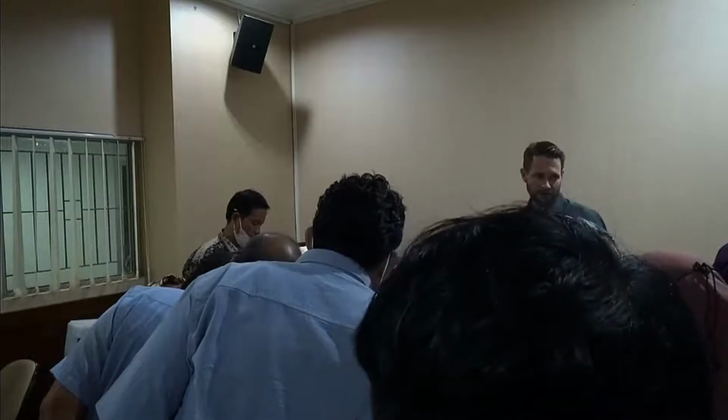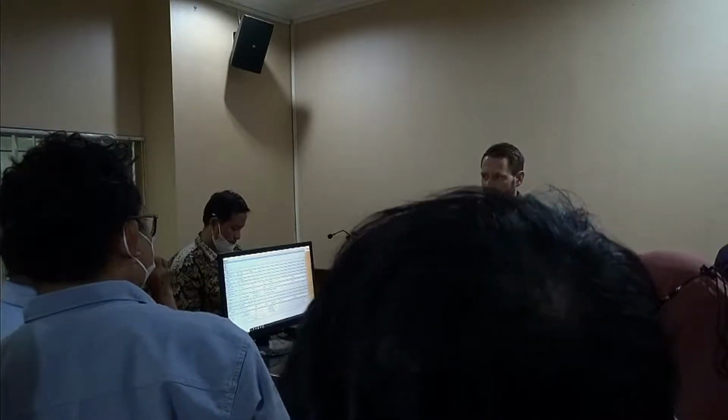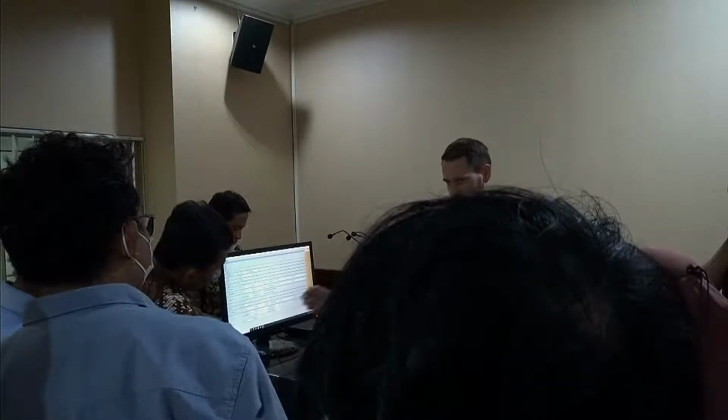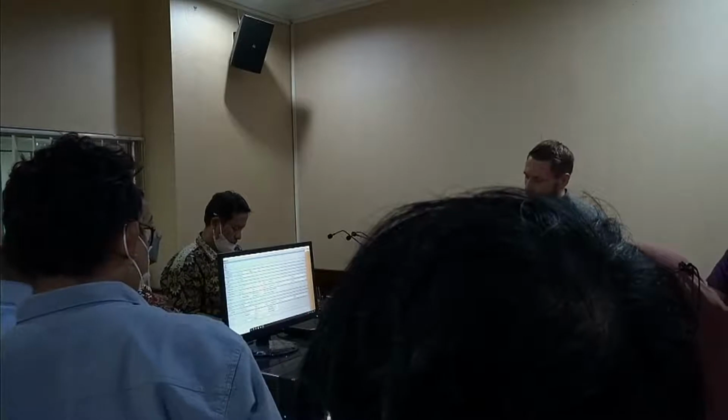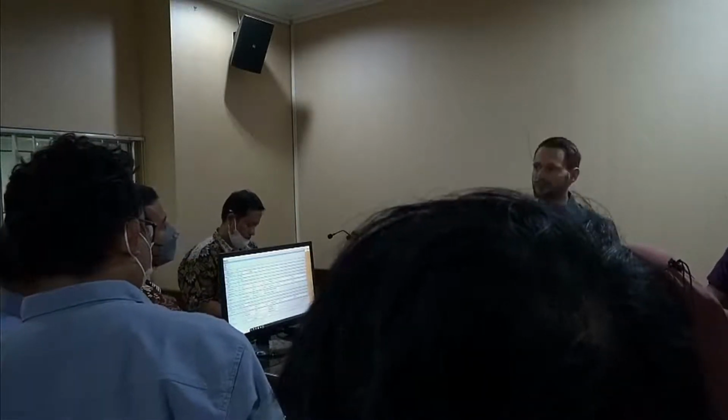One very, very, very important remark from my side regarding these Mie parameters. There are other manufacturers, and I've come across this twice so far, that a customer tells me that they were told by the other manufacturer that they can determine the values. Well, I want to see that. Because we also have an additional software here on the computer, which is called MieSearch, with which you can approximate the values. But if I told you you can determine it, I would be lying.